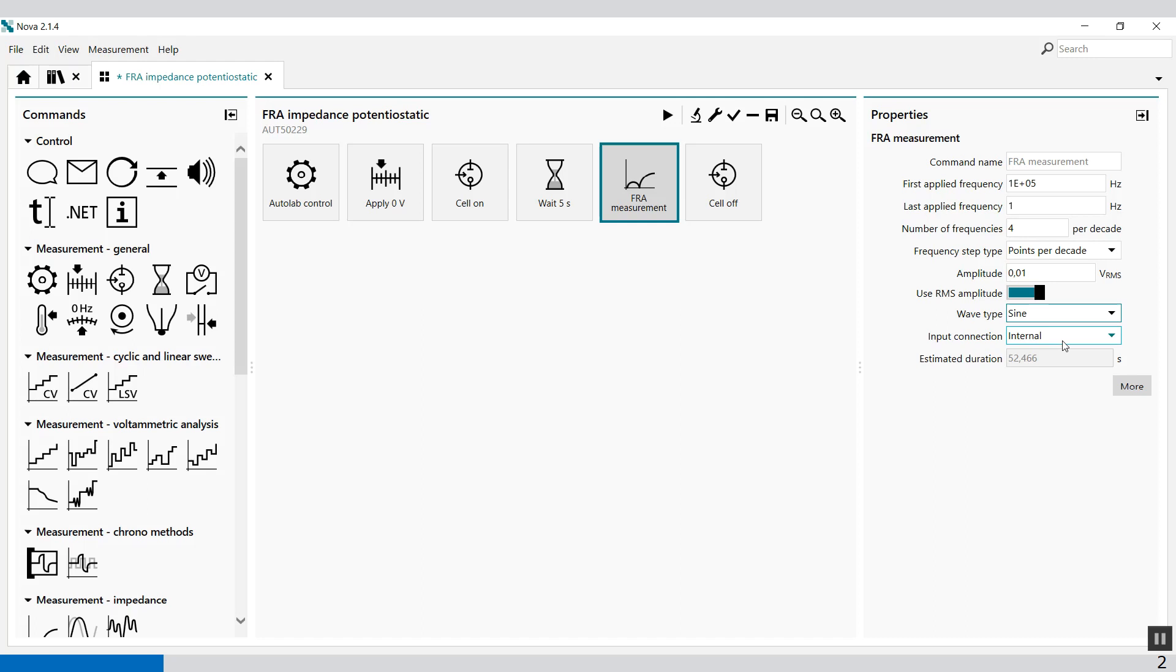The input connections is internal, which means it specifies if the measurement should be carried out internally through the potential set or externally using the external input provided on the front panel of the FRA32M module.